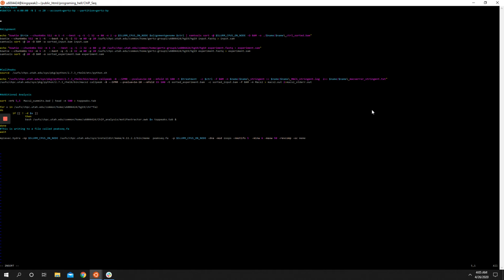So what we can do is the first command, we can take arguments in our program. So again, arguments are the things that are written after the command name. So for this, we'd say something like name. So we can say name equals, so we're setting a variable called name. We can just say, give me argument number 1.